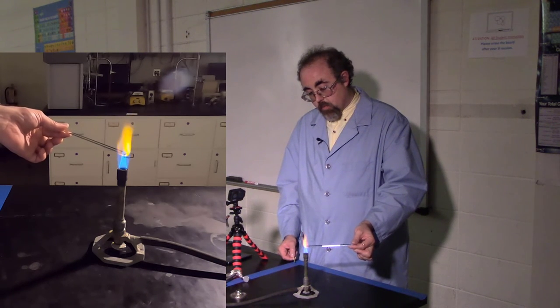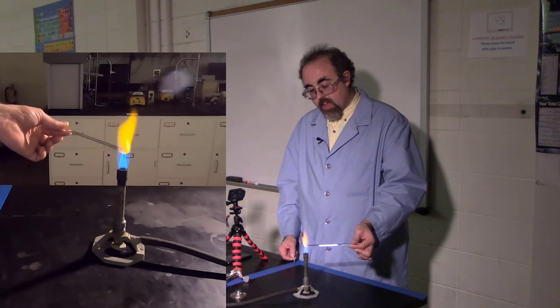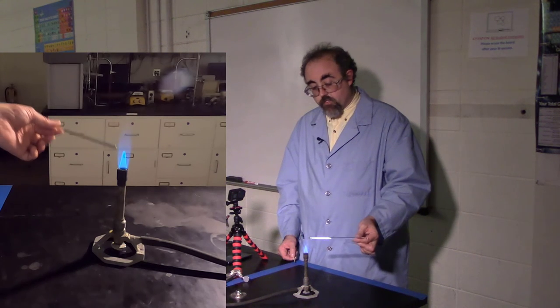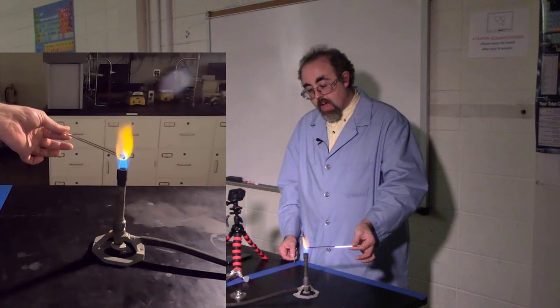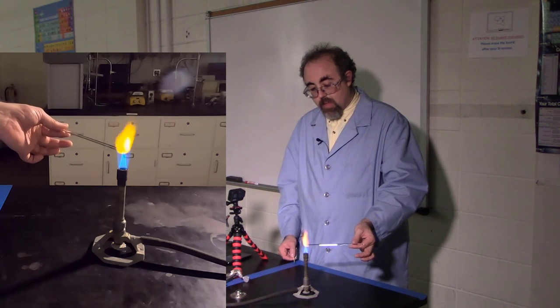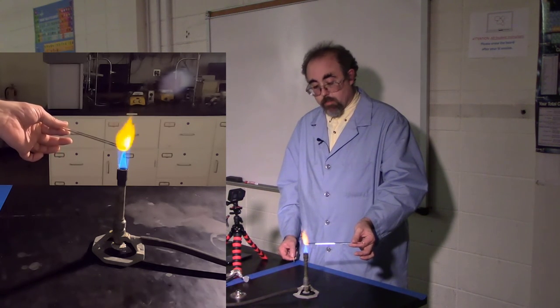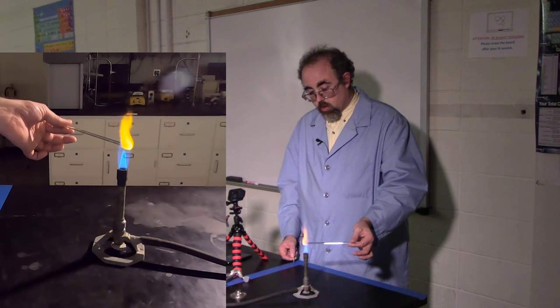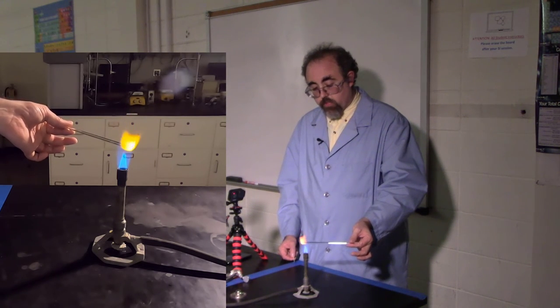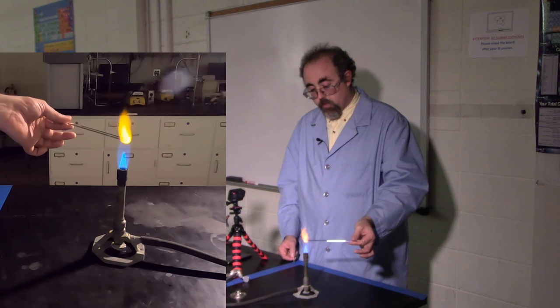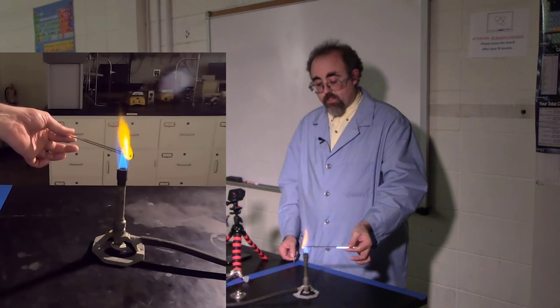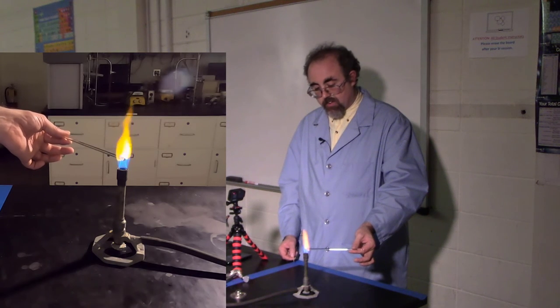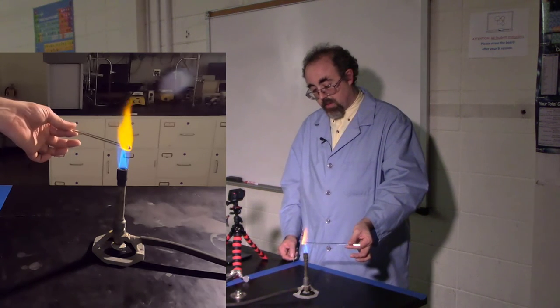But the inner tip of the flame, right where I've got my glass stirring rod, that is the hottest part of the flame. So if I want to do high heat work, like working with melting glass, I would utilize the tip of the inner blue flame. Now, if I want to go a little cooler, let's say I'm using a crucible, I might go for the top of the flame up where the stirring rod is currently. Of course, I might put something down a little bit further if I just want to get lots and lots of heat, not necessarily high temperature, just lots and lots of BTUs coming out.